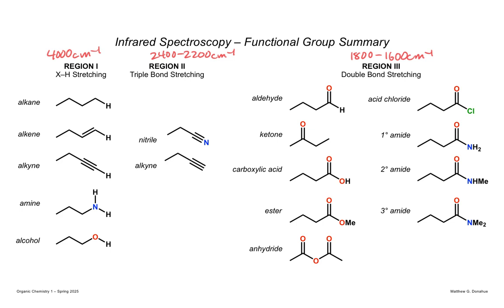Within region 1, we have alkane CH stretching. So I'm going to use that word stretching, and I'll define it a little bit later.